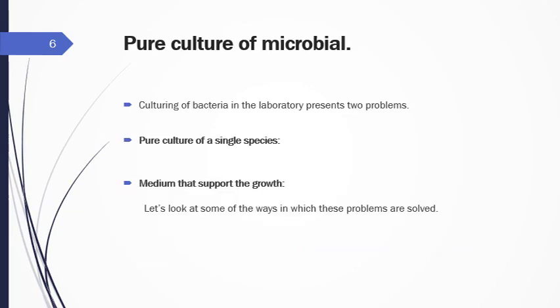Critical to the development of microbiology during its golden age was the advance in culturing techniques, enabling the isolation and pure culture of specific microorganisms. The study of pure cultures made it possible to determine the properties of specific organisms, such as their metabolic characteristics or their ability to cause particular diseases. It also opened up the possibility of classifying microorganisms on the basis of the characteristics they display in pure cultures.